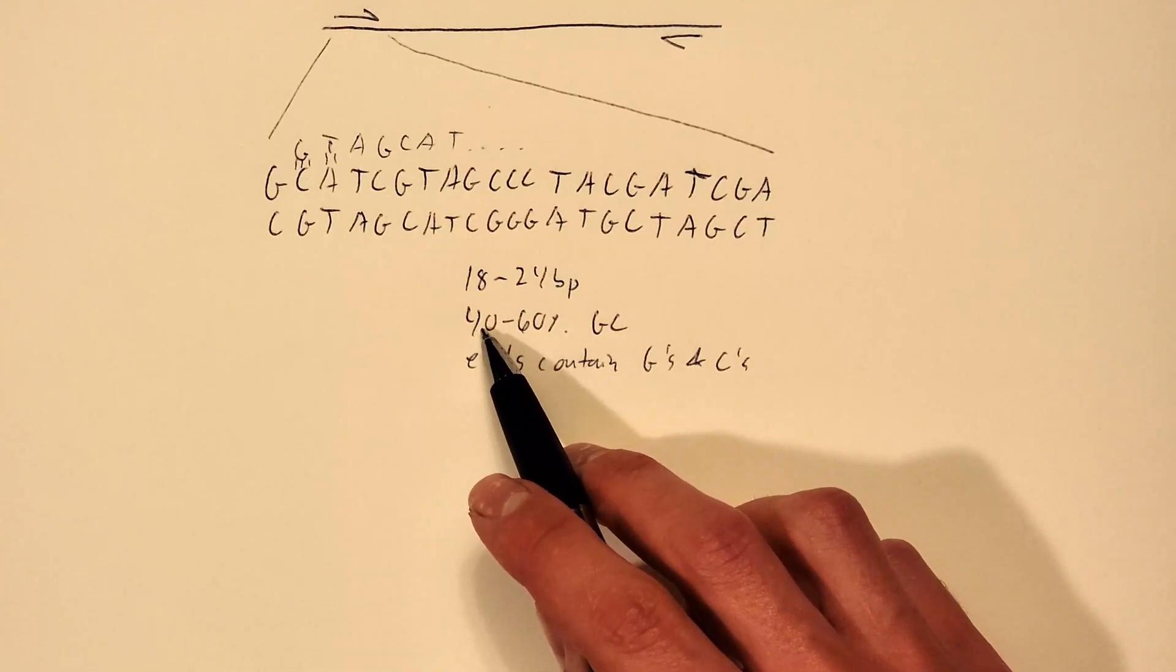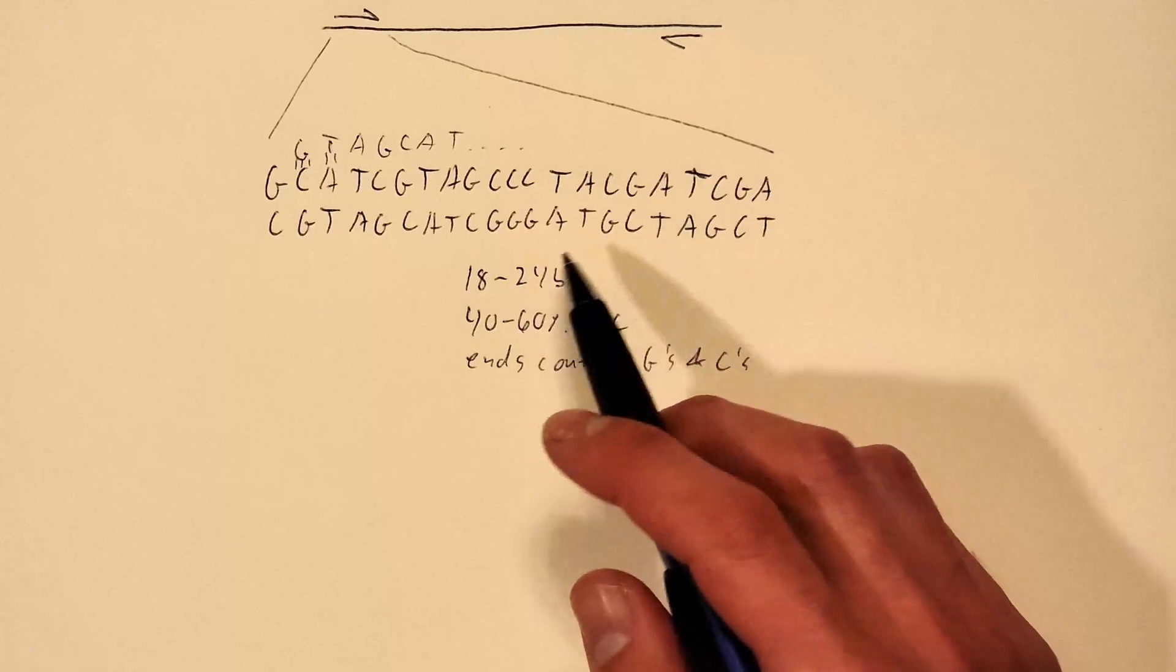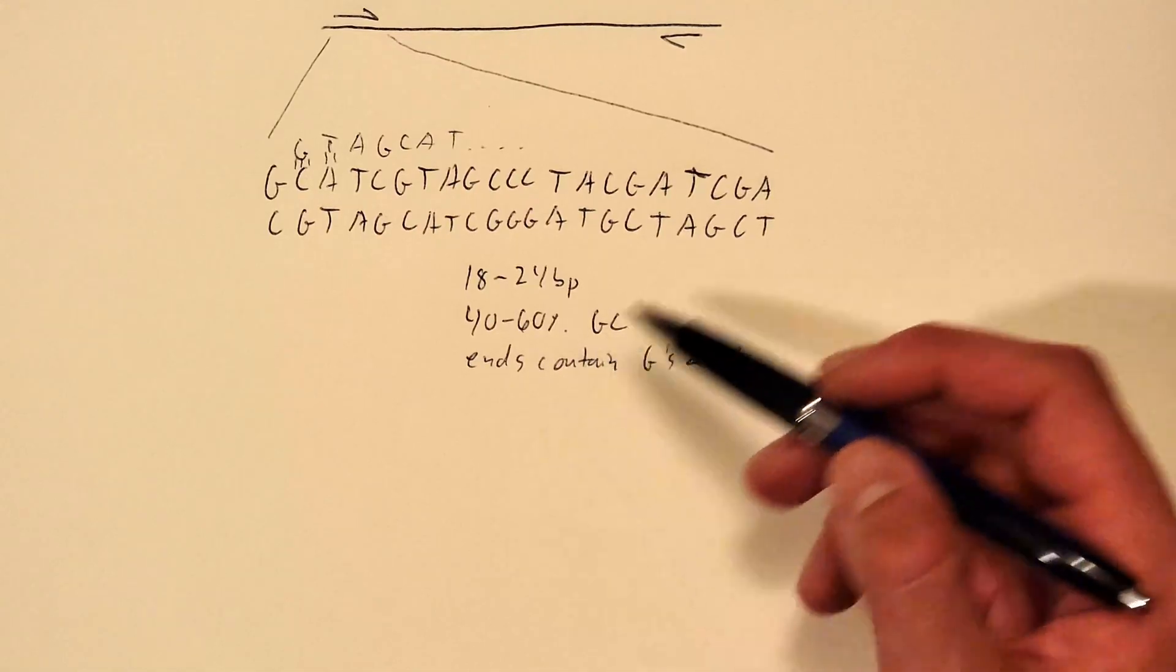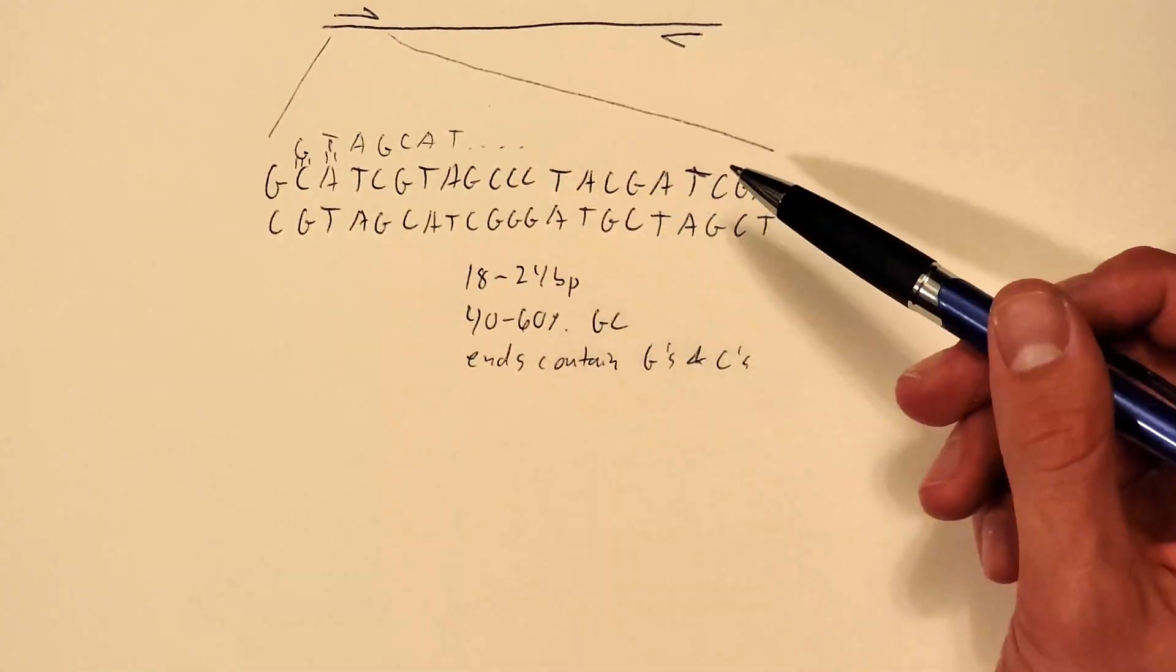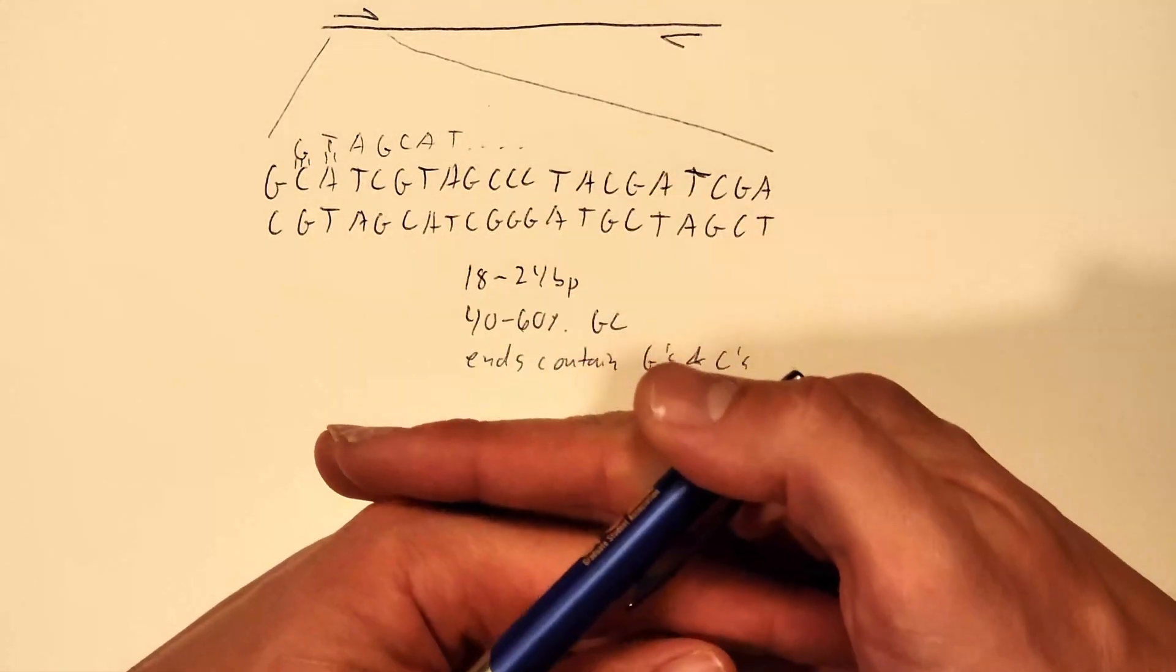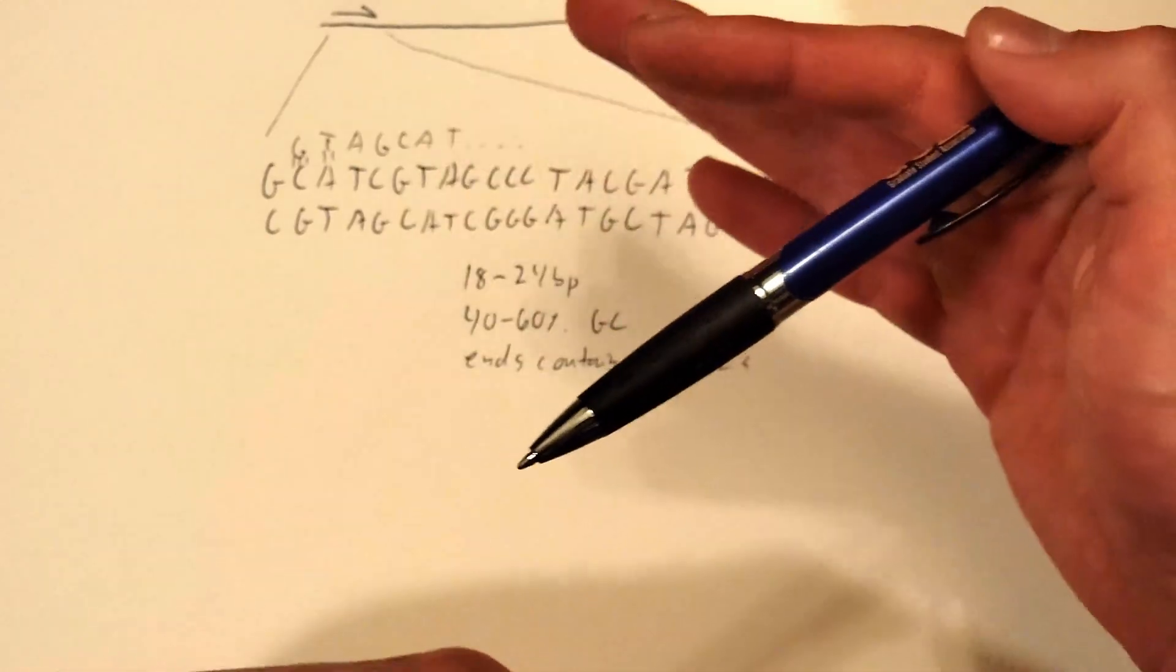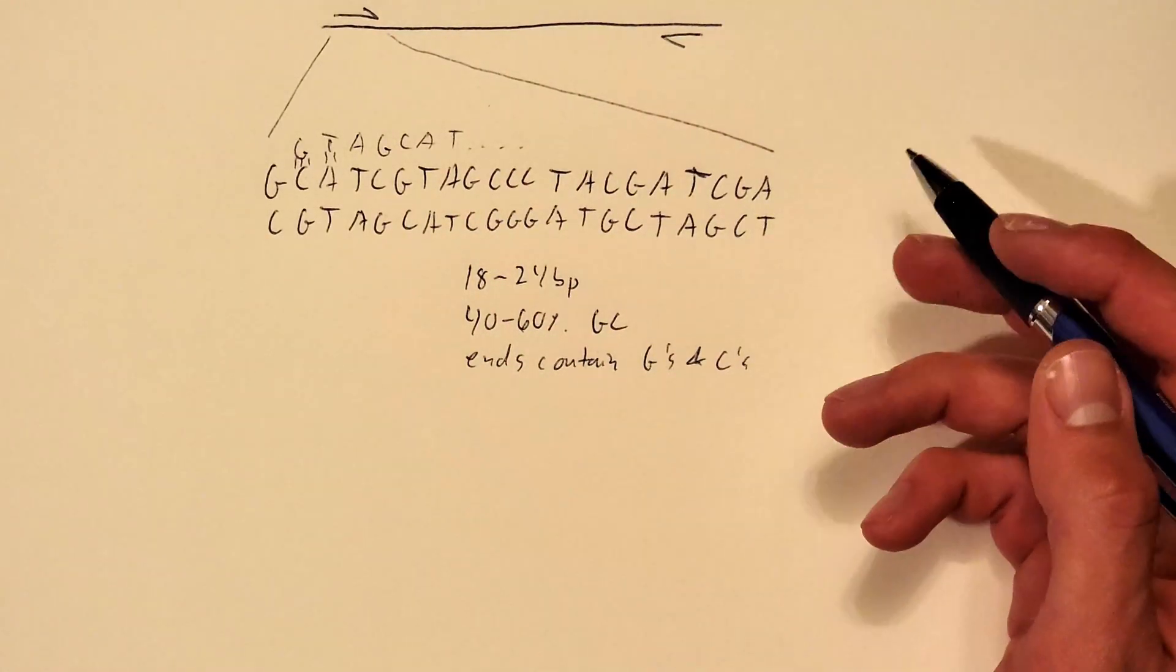If your GC content is really low that means you have a lot of A's and T's so it's AT rich, it's going to bind really weakly to your DNA sequence. If the GC content is very high it's going to bind really strongly to your sequence which sounds great but remember in PCR you actually need the pieces of DNA to come apart from each other. So if the pieces of DNA can't come apart from each other first then your primer is never going to bind in the first place.